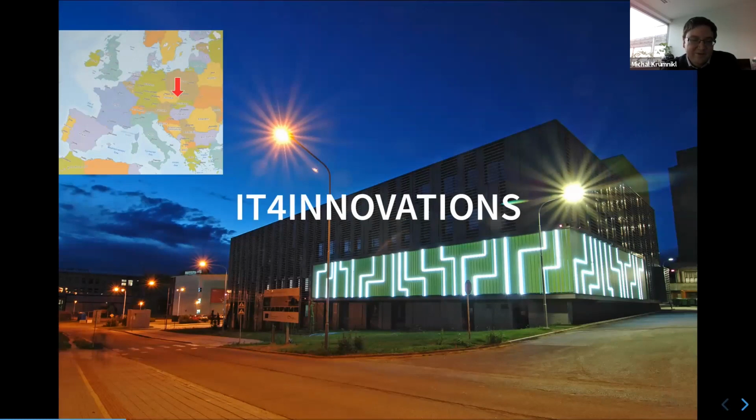This is the building of IT4I Innovation. It's in Ostrava in the Czech Republic, in the heart of Europe, and Ostrava is located in the east part of the Czech Republic. In this building, your code will run in just a few minutes, during the session. So you can imagine that your code will just run inside the building in Ostrava.